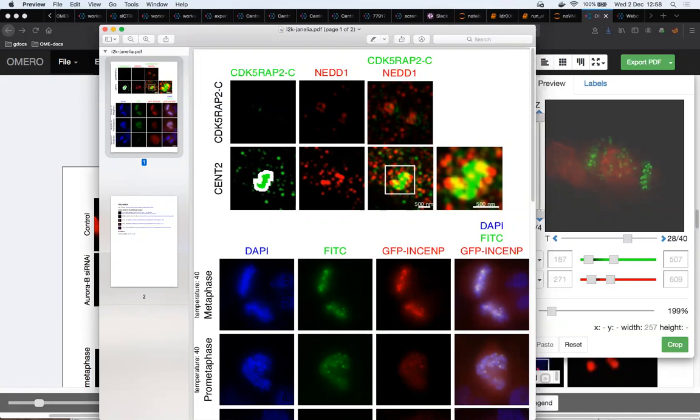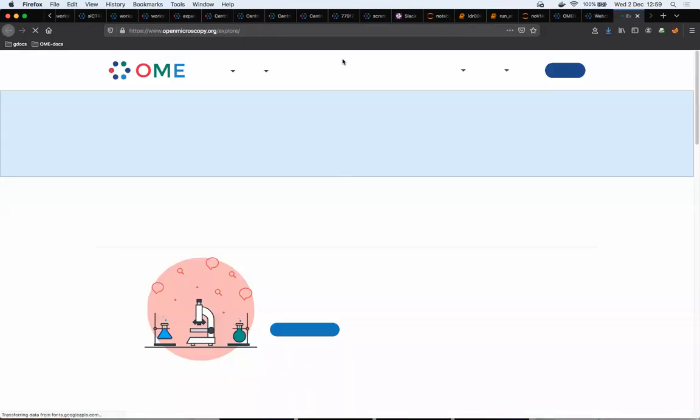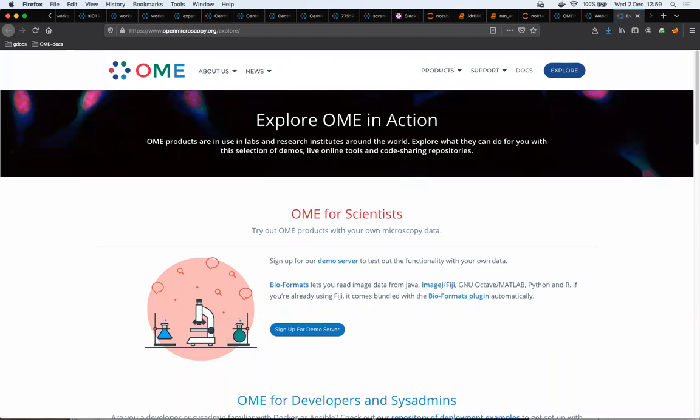Okay. Thank you very much for your reactions. You know, it's quite common that people like OMERO.figure. It's really likable. I just put a link in as well, if people are interested and do not want to install the server, because obviously everything we've shown you, you need to have a server installed. And if you don't have a server installed and want to see if the tool will meet your needs, you can request a demo account that's free of charge, and then you sign up for a demo account.